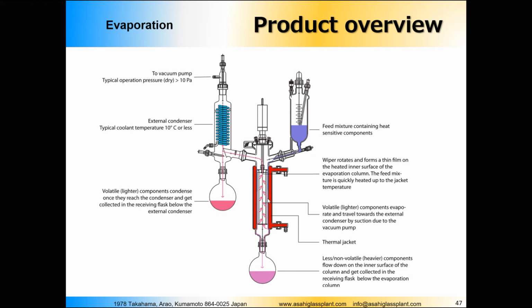Well, we can, but the problem is that, as I told you, we're trying to separate two high boiling components. Although the other component is slightly lighter in terms of the boiling point than the first component, still when it evaporates from the wall, it will not be able to get to the condenser, because the path that this component needs to pass is too long.